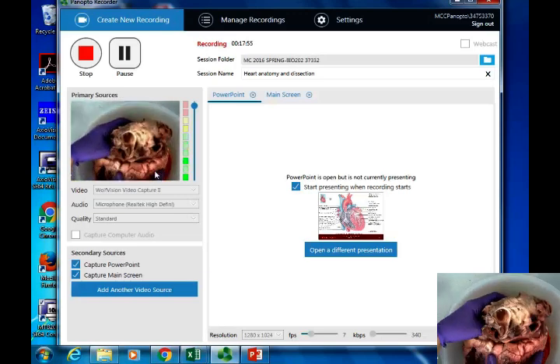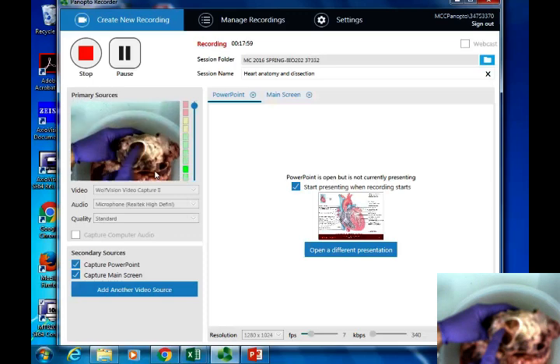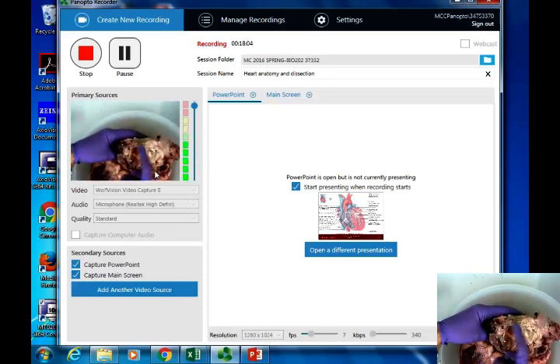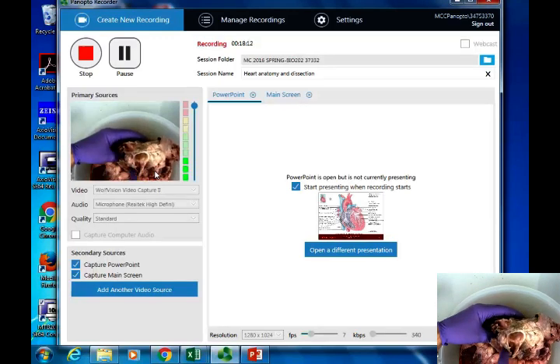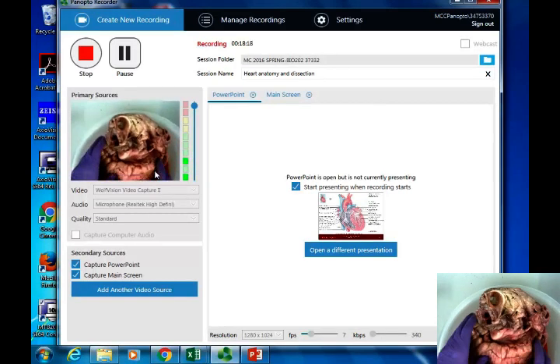Another unique aspect of this one, though, again, we see some of the major blood vessels here. Here is a section of the trachea going into the bronchi. This white ring that you see right here, that's a hyaline cartilage ring that's holding open this air tube. And you can see how it branches into multiple other bronchi as we continue on there.